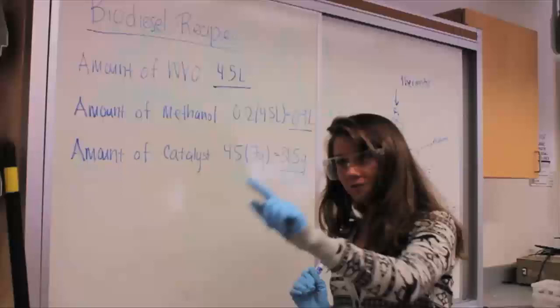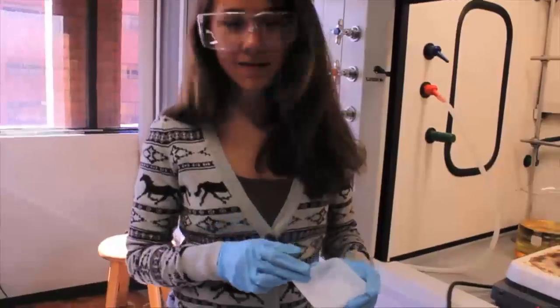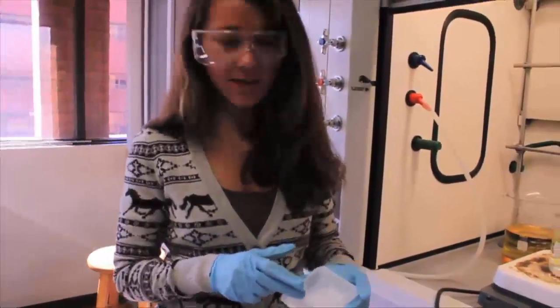You need to mix the methanol and catalyst, since the methanol is a liquid and the catalyst is a solid. We're doing that over here, which I'll show you in a second, and then we're going to mix it with our biodiesel in the reactor. So this is our catalyst, KOH. It comes in a solid form.